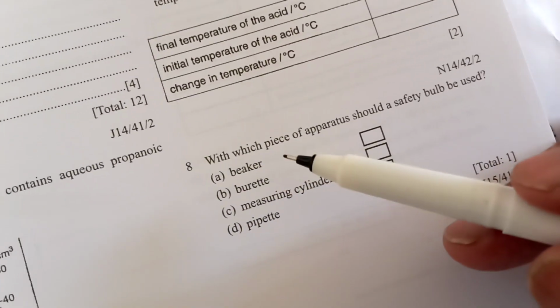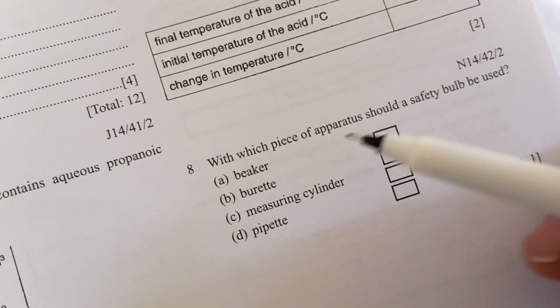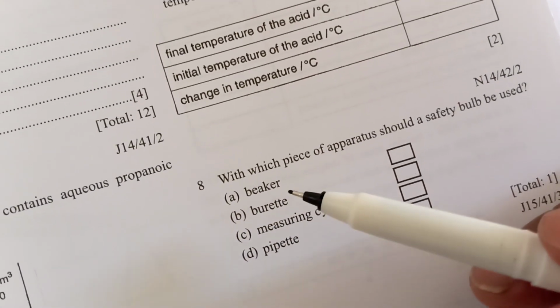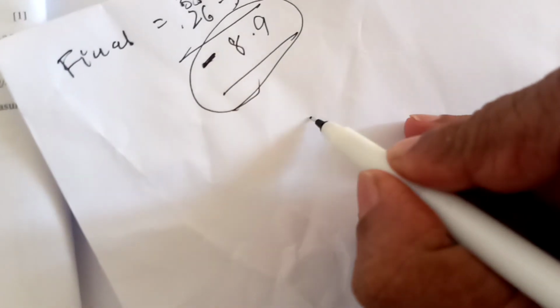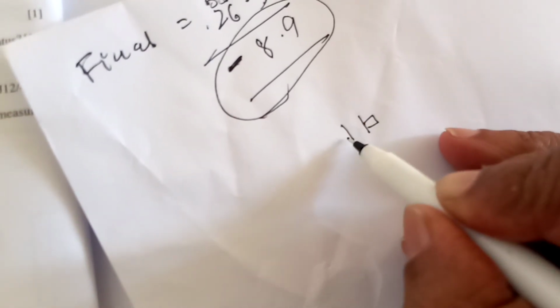So with which piece of apparatus should a safety bulb be used? A pipette. We use a safety bulb. Safety bulb is like that.